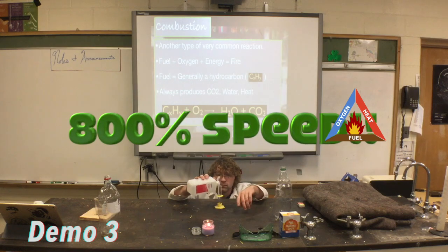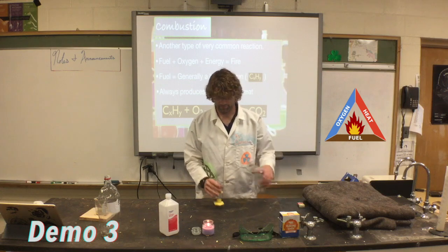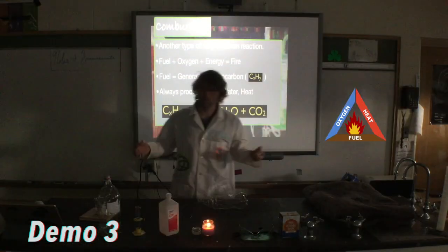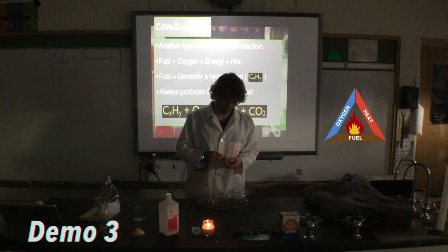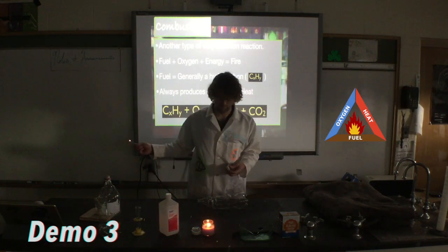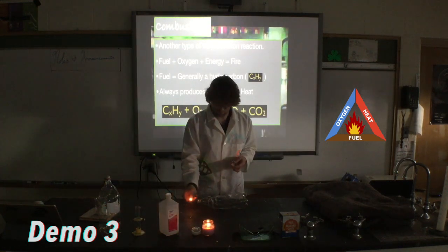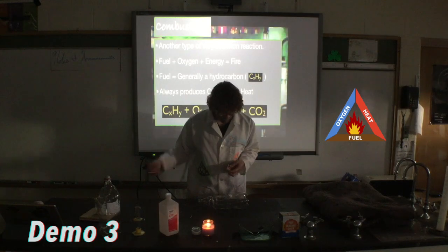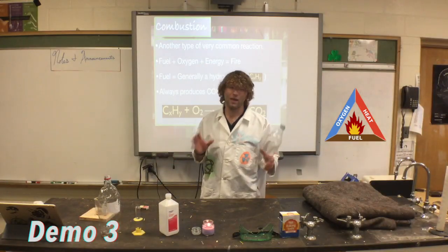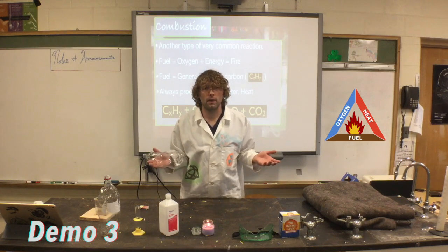Okay. 5 milliliters of fuel. For demonstration number 3. So what should have been very readily apparent in this one is we didn't get a lot of combustion.